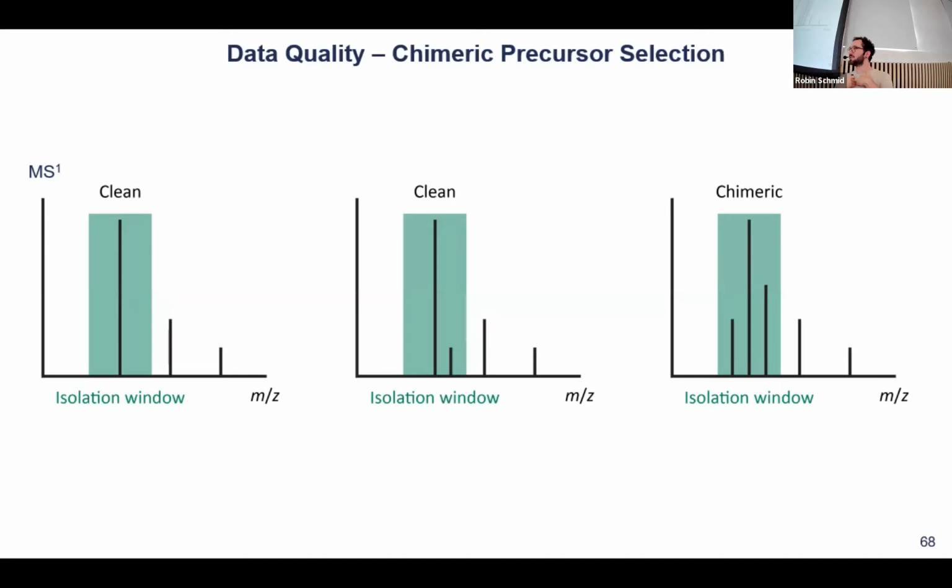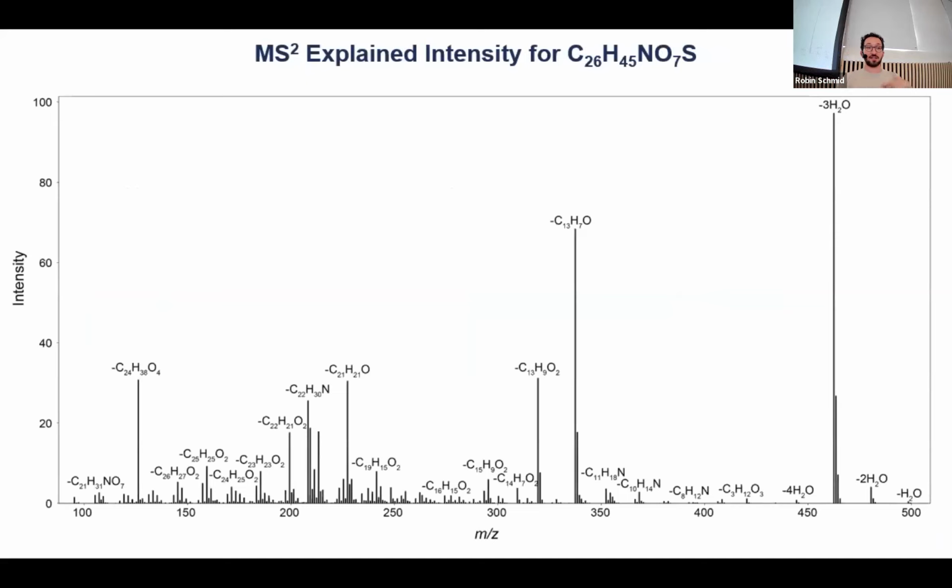So I don't want to tell you that I know how to process spectra. I just want to tell you, I did process my spectra with those settings, and this is the library that I exported, and you can use it, and you know what happened to the spectra. Yeah? And in the next step, we can also go through and maybe do some sanity checks on the spectrum.